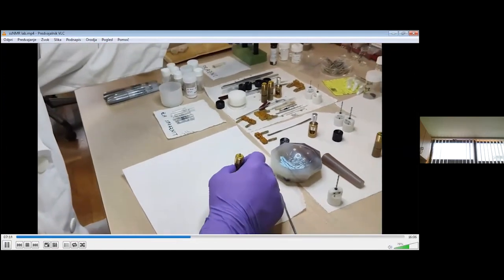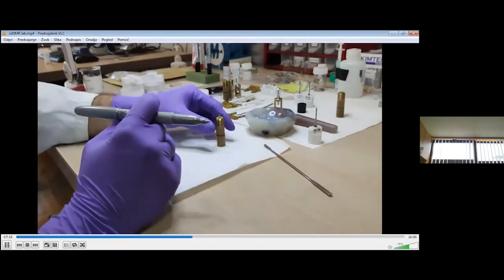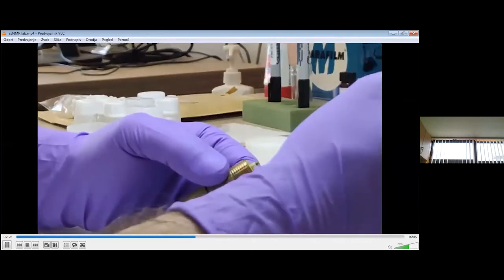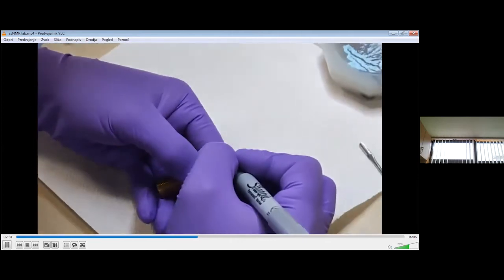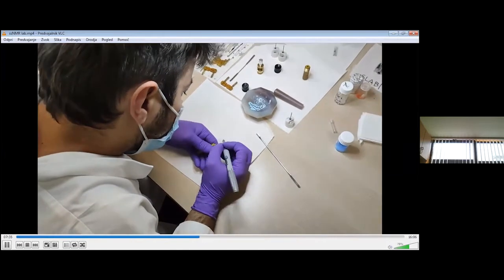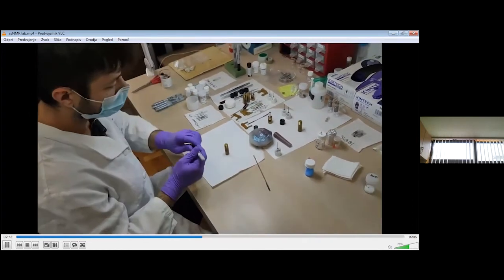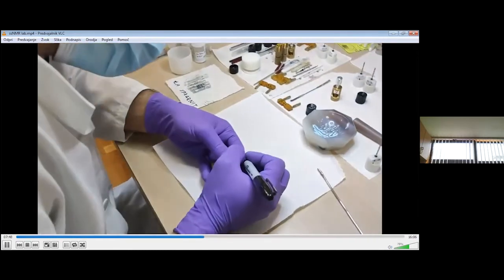At the end, we also color the rotor with two different colors so that we can follow the spinning rate with the laser detector. We use silver and also black color to give a contrast.